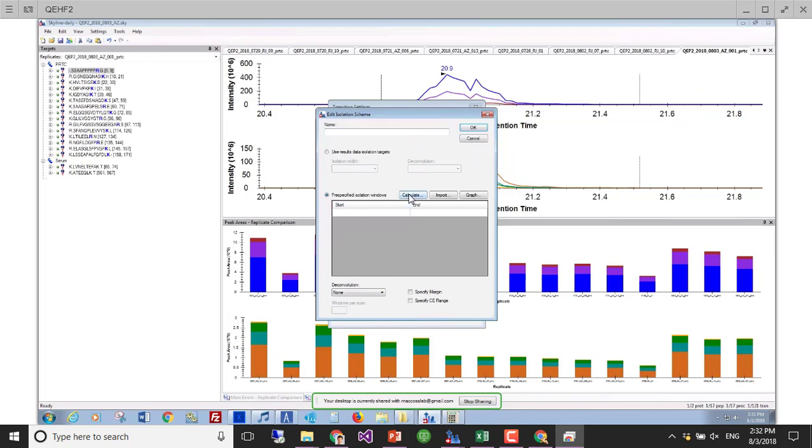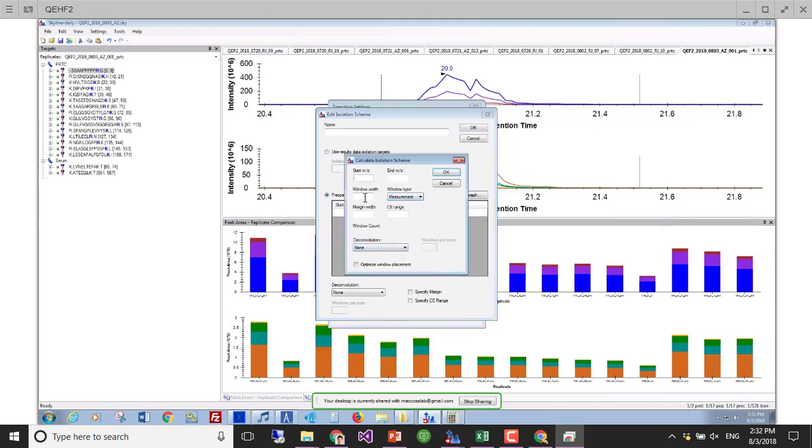So what I'm going to do here is first run the calculator, and I'm going to say from 500 to, let's keep it the same, 400 to 1,000, just like that, with 24 m/z wide windows, right? And I'm going to optimize the window placement, and I will set these for overlap so that we can see the structure of what that file looks like, okay?